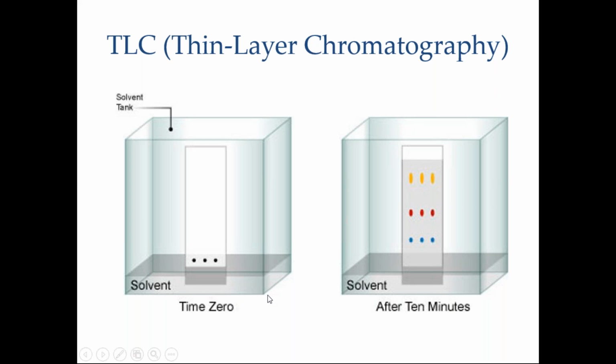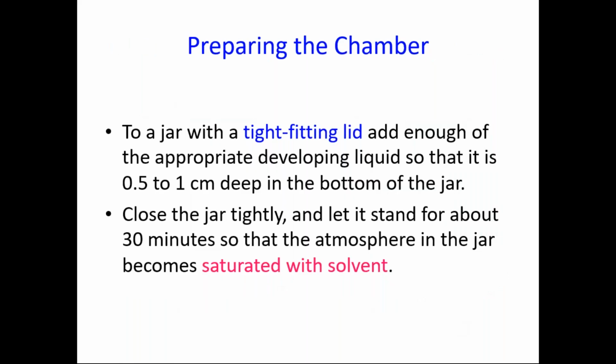It's a covered tank, and after the separation, you see that the analytes have moved and separated. If they are colored analytes, you can see the difference in the color. Otherwise, you have to use techniques very similar to paper chromatography to identify these spots.